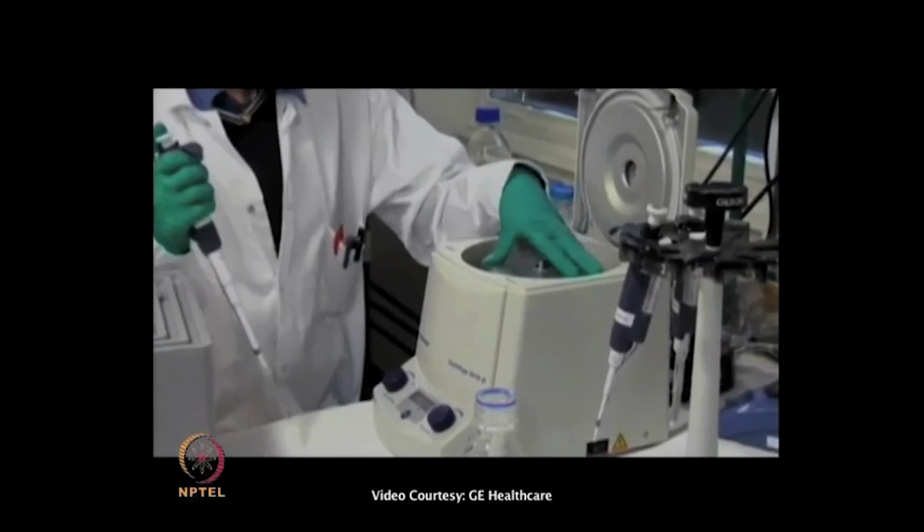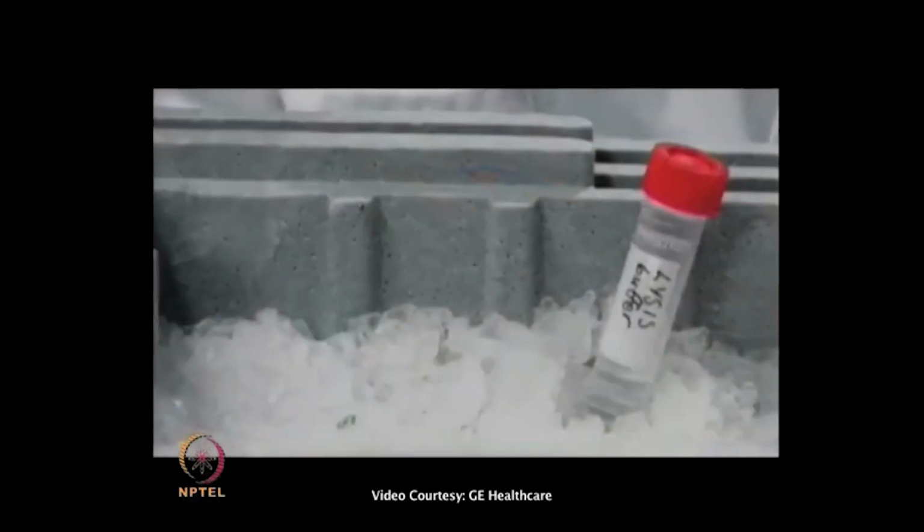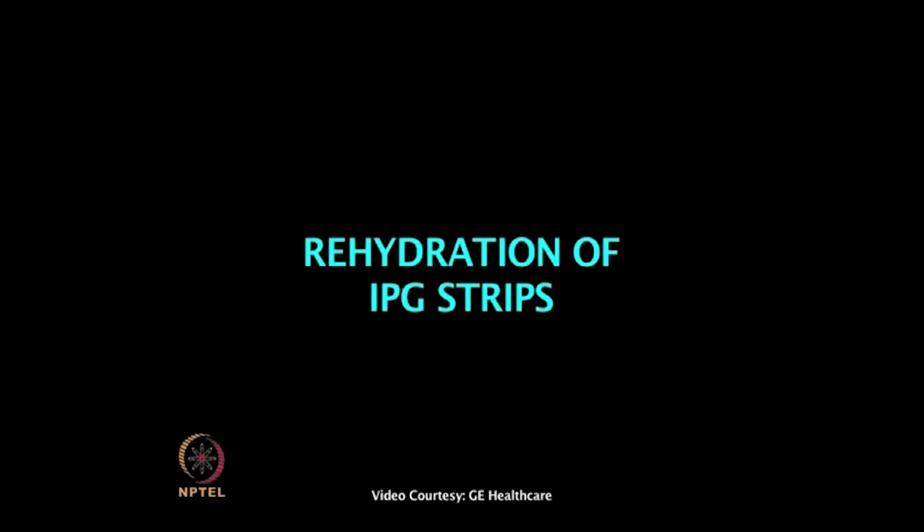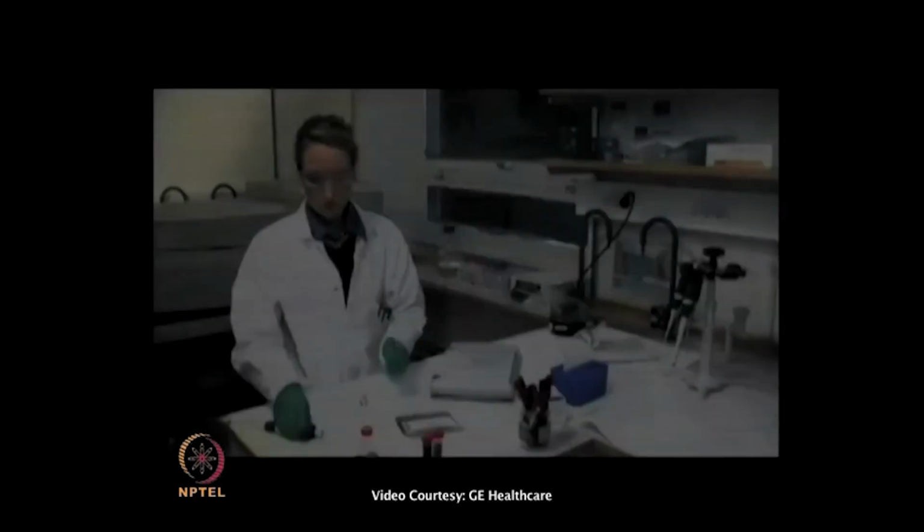The proteins on the cell surface are now labeled and the cells are washed and ready to be lysed. The pellet from the last washing step is resuspended in 150 microliters of cold lysis buffer containing 7 molar urea, 2 molar thiourea, 4% CHAPS, 30 millimolar Tris, 5 millimolar magnesium acetate pH 8.5 and left on ice for at least 1 hour with occasional vortexing. The samples are now ready for 2D gel separation.